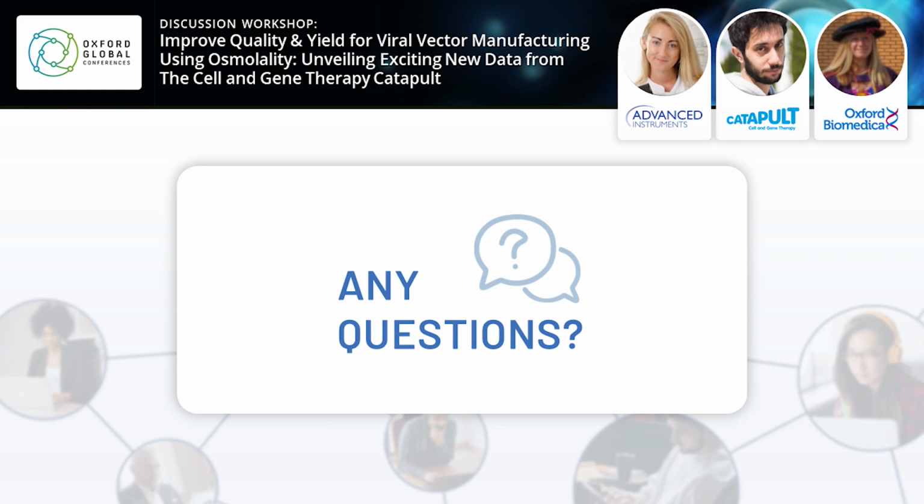Thanks, Emma. I think the first question that's just come through I'm going to take. So the question is, how far off is an inline osmolality test? So we actually get this question very commonly at Advanced Instruments, and a lot of our osmometers are used at line, but in terms of inline or online sensors, it is something we're looking into, and we are really focused on getting an instrument out there. However, unfortunately, we don't really have a specific date or a timeline to give you. But yes, it is something we're working on, and we hope to bring this out in the future at some point. So thank you for that question.